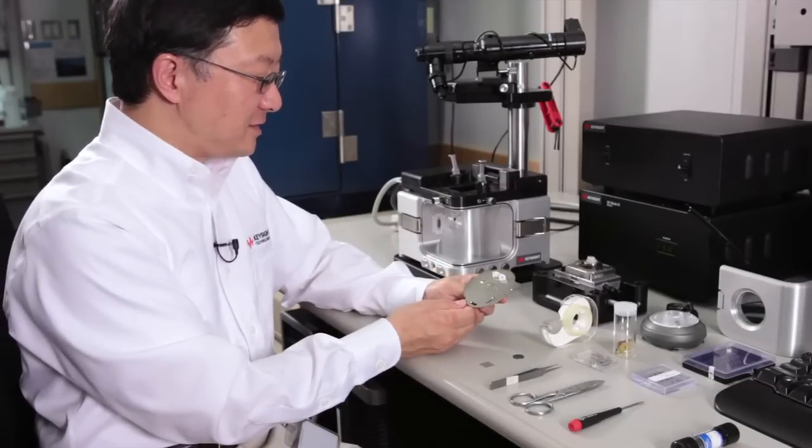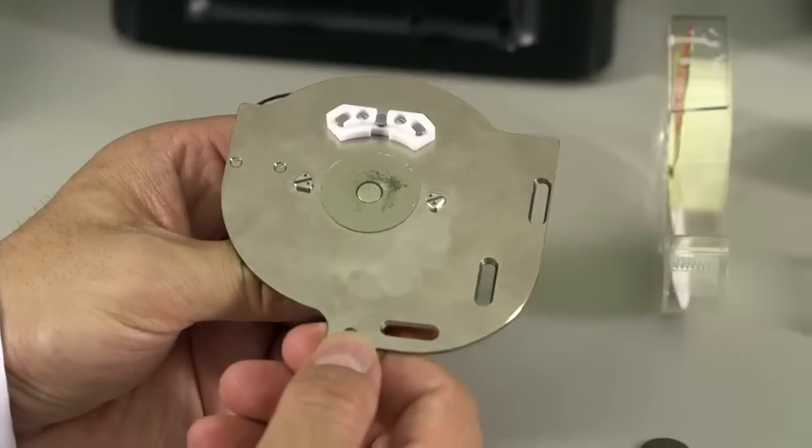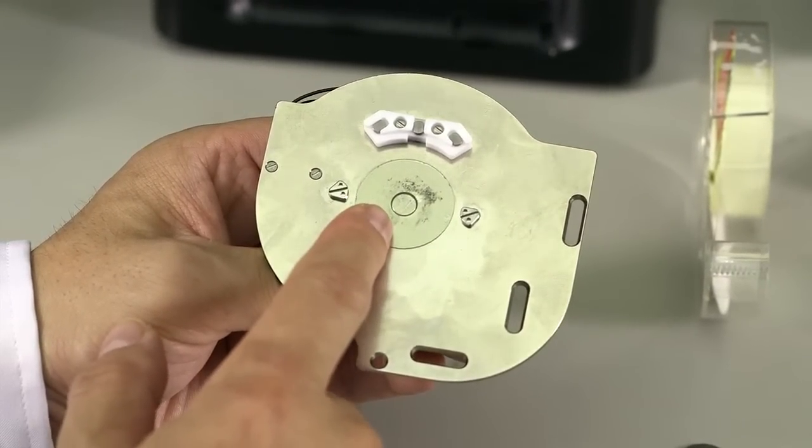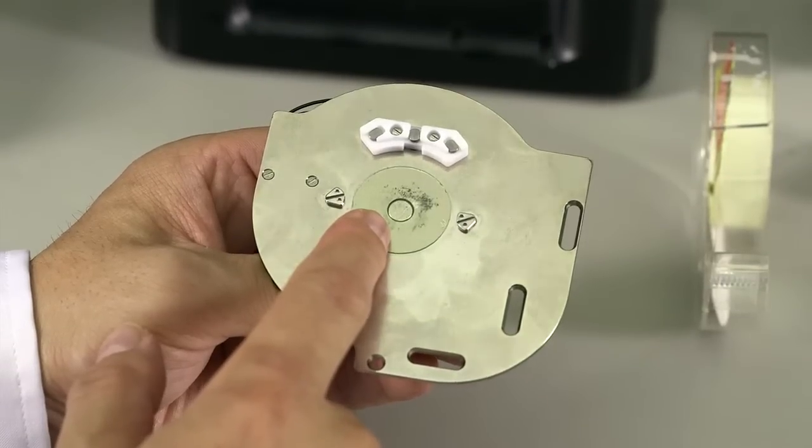This is the AFM's basic sample plate. In the center of the sample plate, there is a magnet to allow you to assemble your sample dish on top of it.